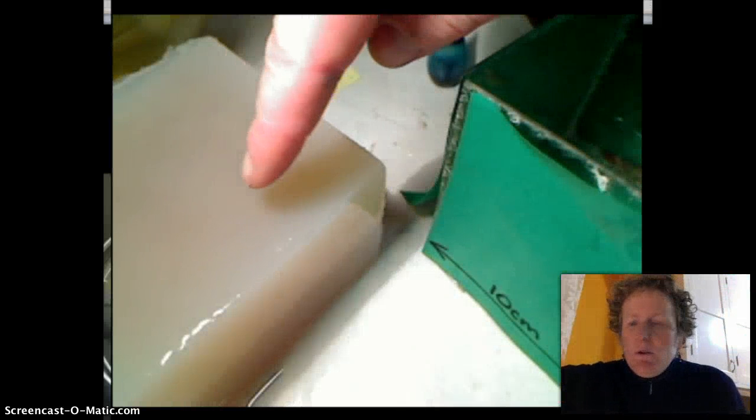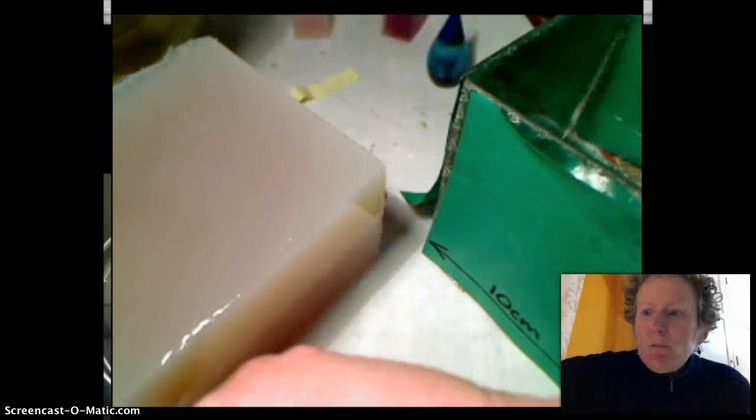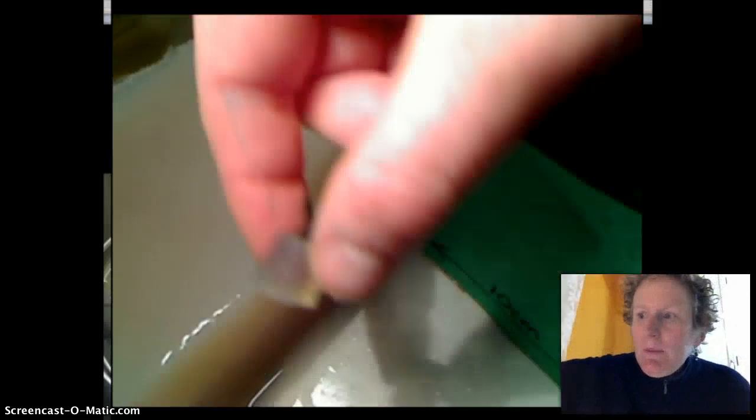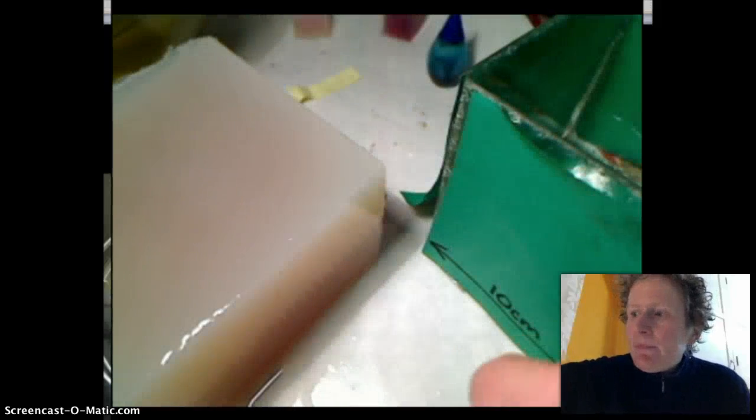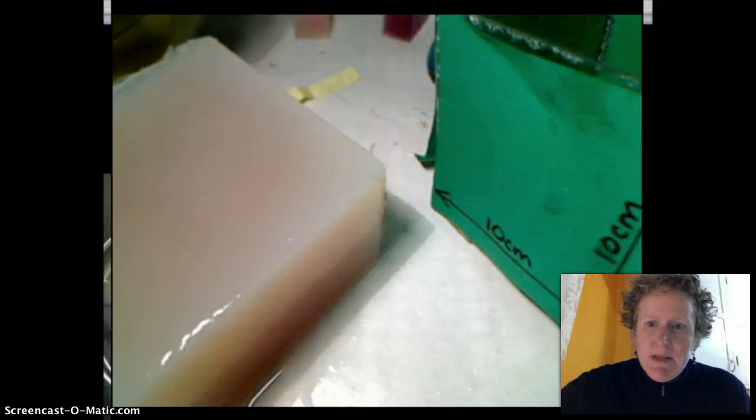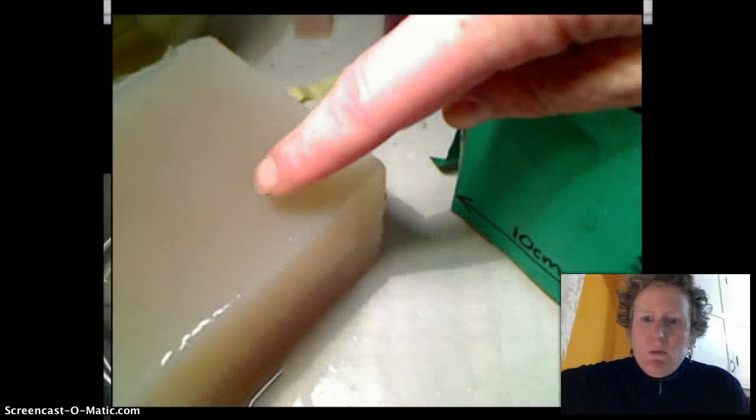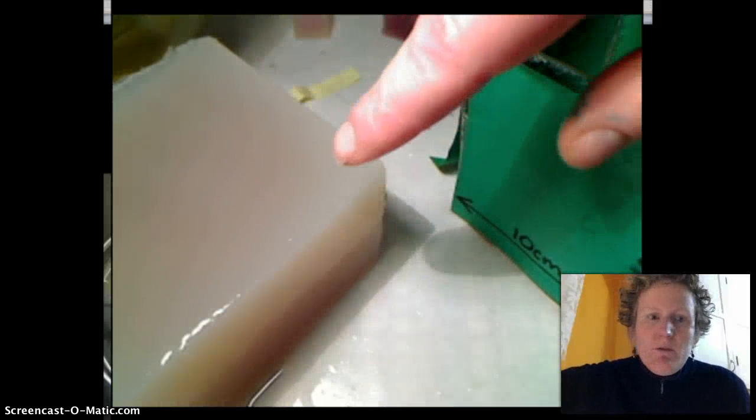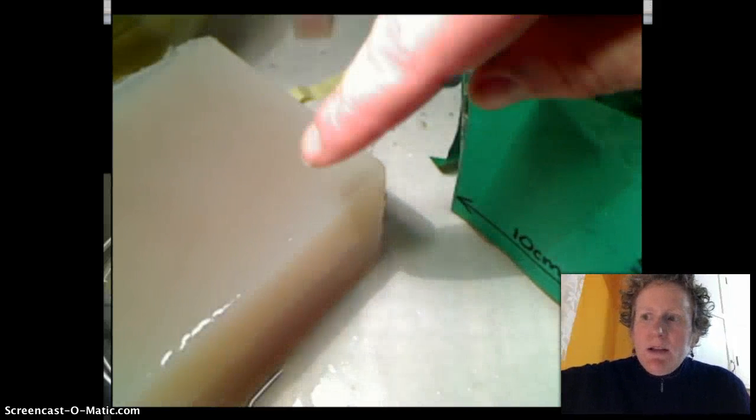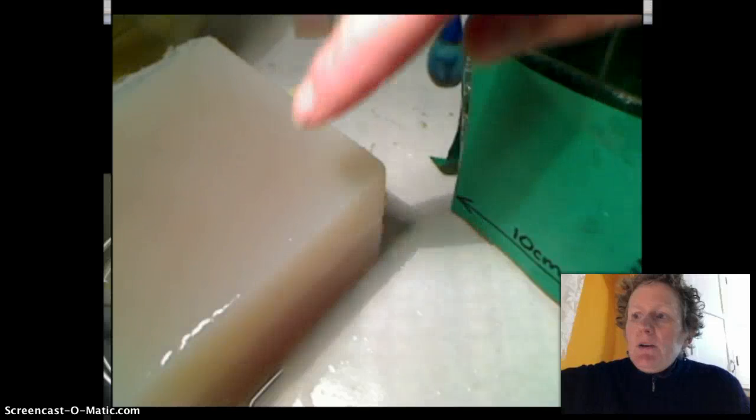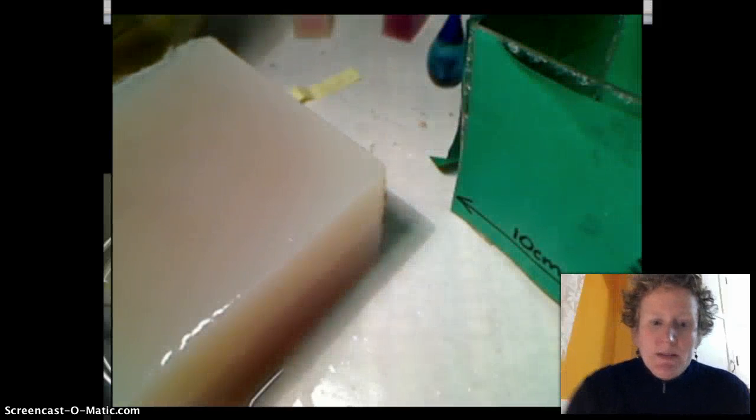This agar cube is big, much bigger than the little cube we just cut open. Here's a little size comparison. It's about the same size as this one. This cube has actually been soaking in vinegar for about 48 hours. Let's cut this one open and see how diffused a really big cell is.